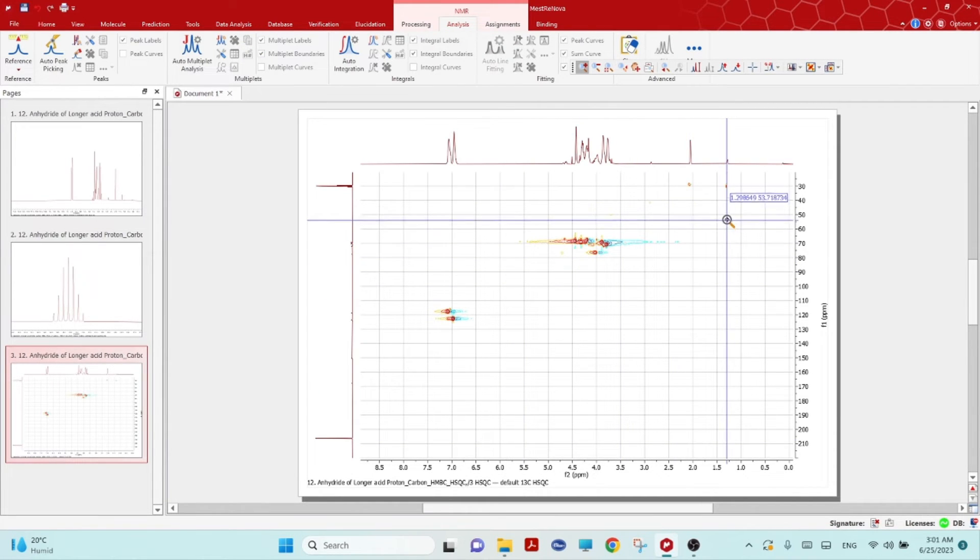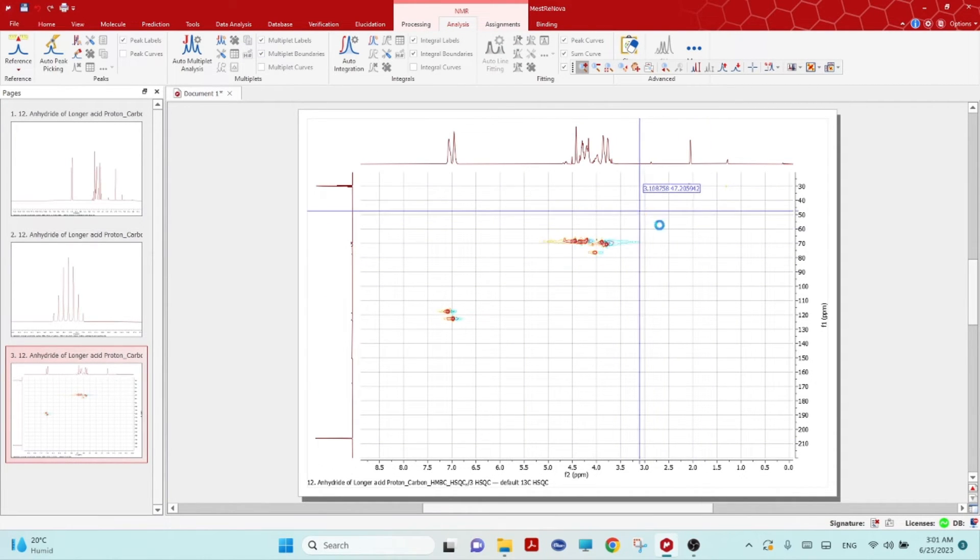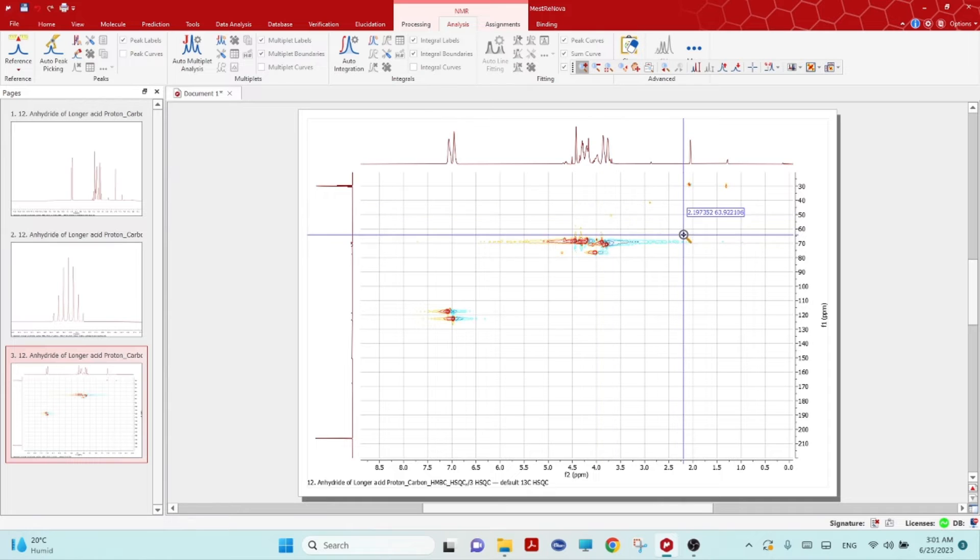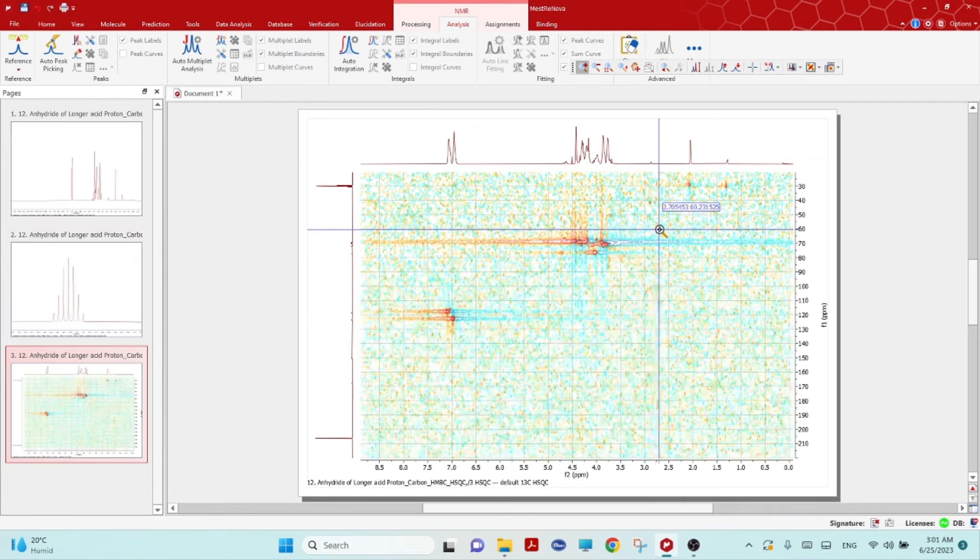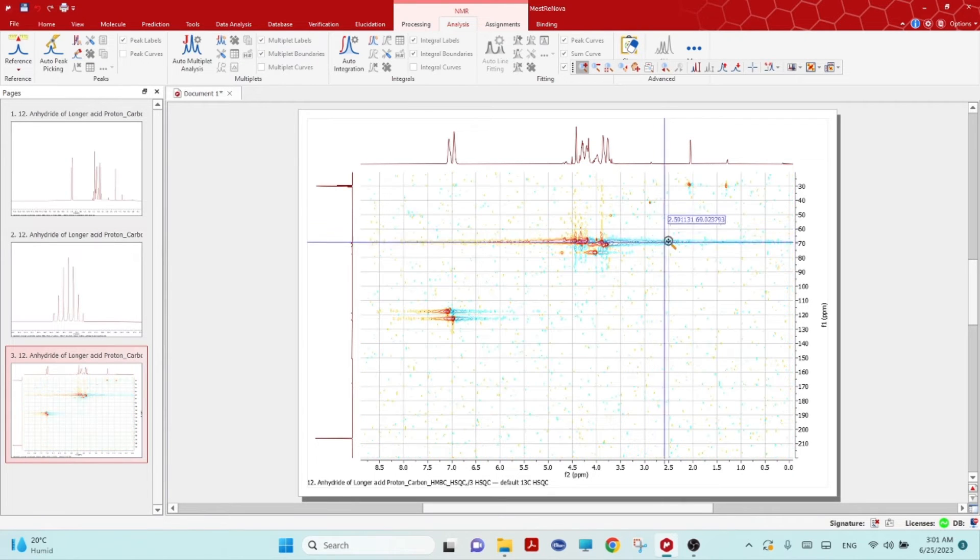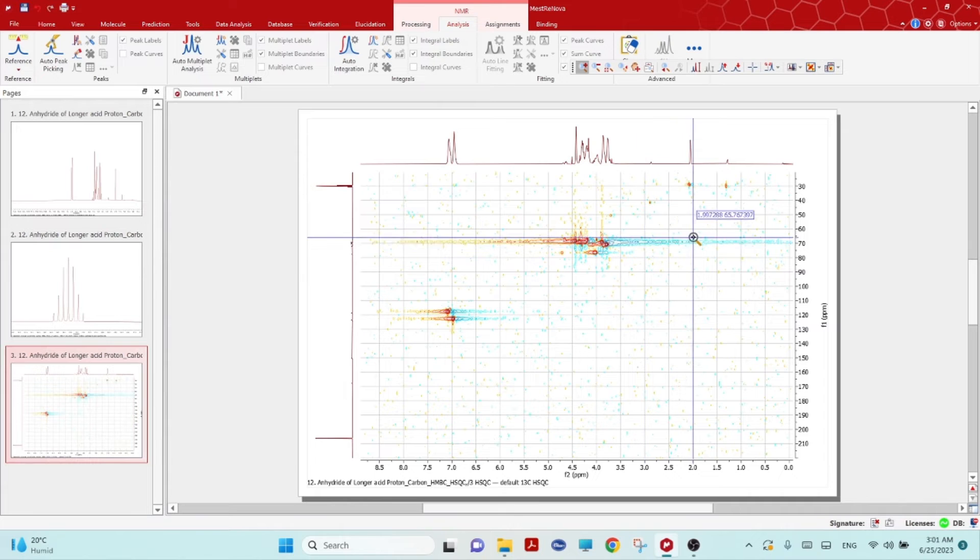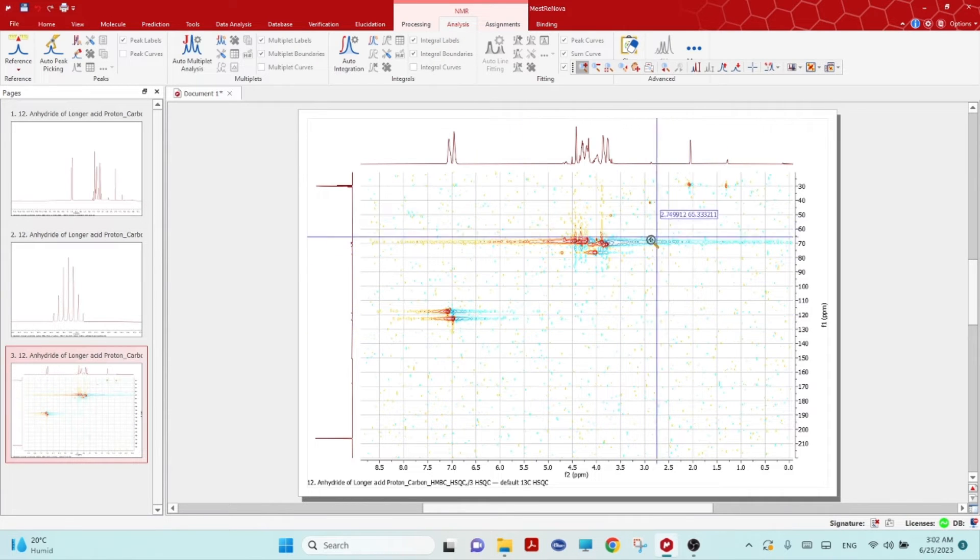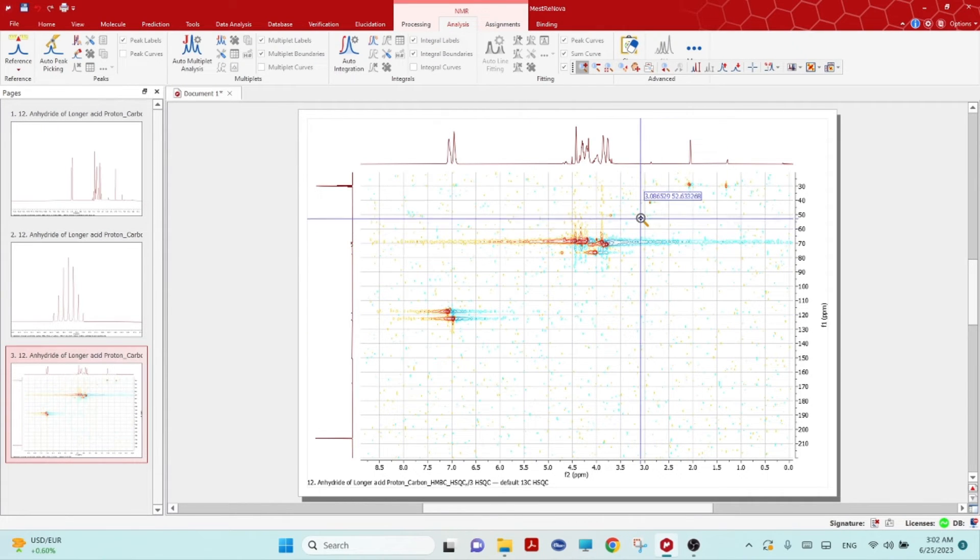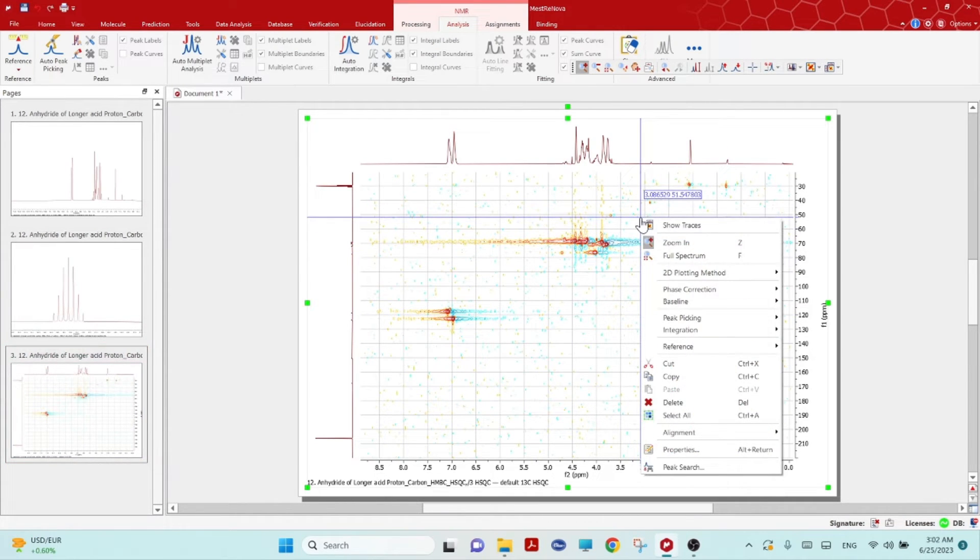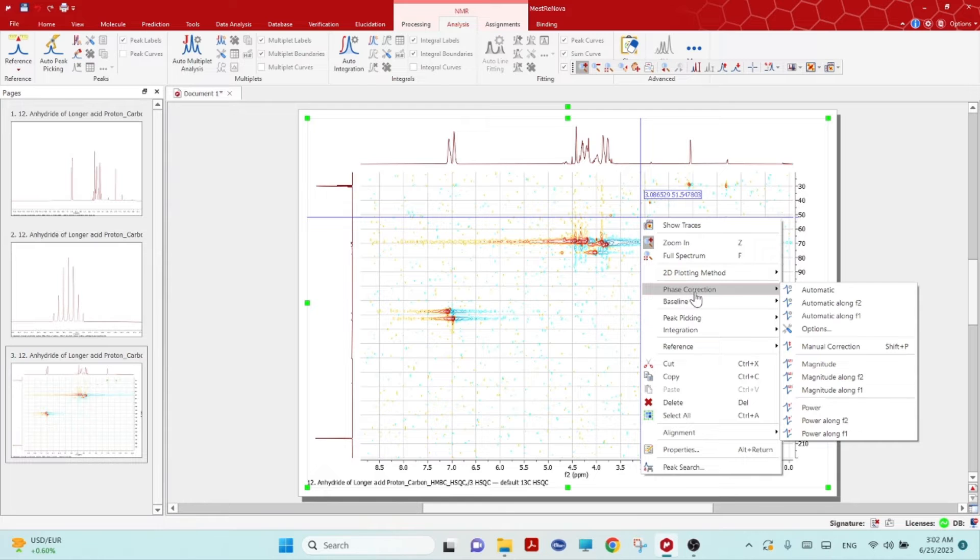Now before starting anything, if you scroll up or down, you will see some this blue thing artifact. Right mouse click and go to the phase correction, click automatic so it will do the automatic phase corrections.